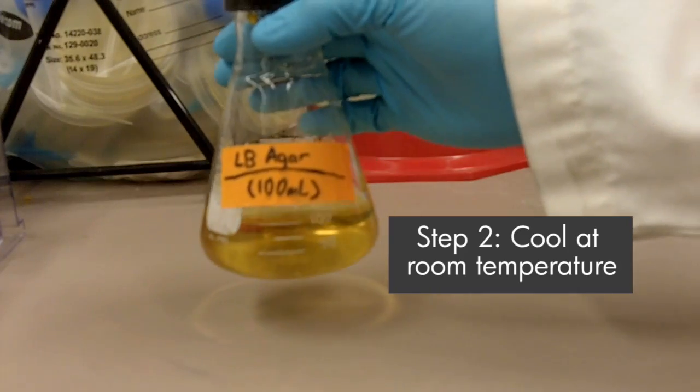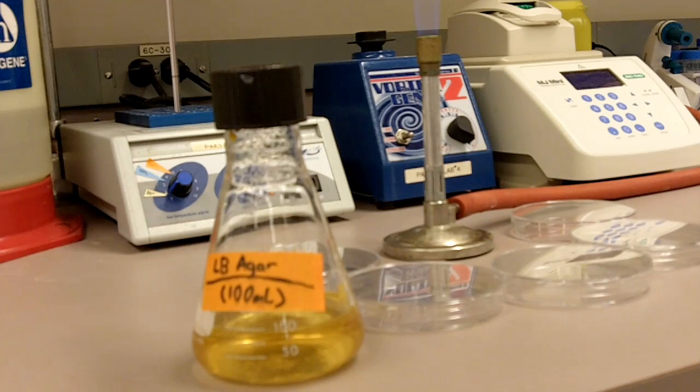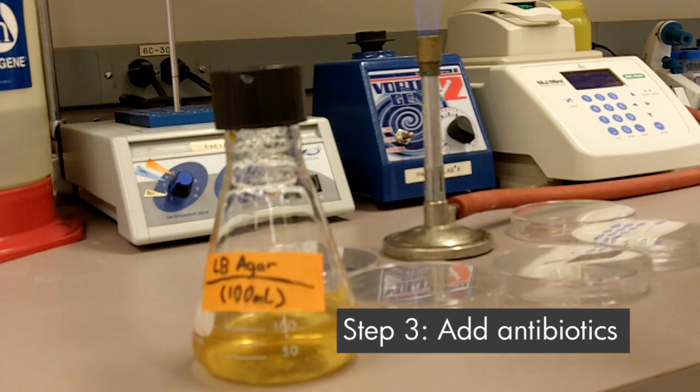Now we're going to cool down the agar. The agar cooled down at room temperature for approximately 15 to 20 minutes, and then now we can add the antibiotics to it.